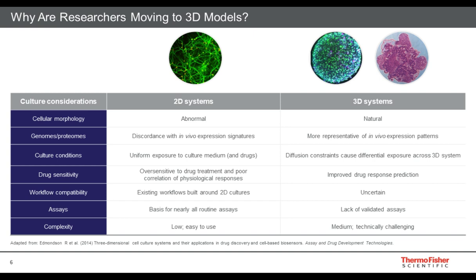This is particularly true when you think about the types of assays that are available, and the ability to either lyse a microtissue versus a monolayer of cells, or the ability to label cells that are not on the surface of a spheroid for doing imaging type analyses and things of that nature. So there are certainly some trade-offs and challenges still to be met around workflow compatibility and assays. And of course, this all leads to an increase in complexity, which is good, but that also makes things in general more challenging to work with.